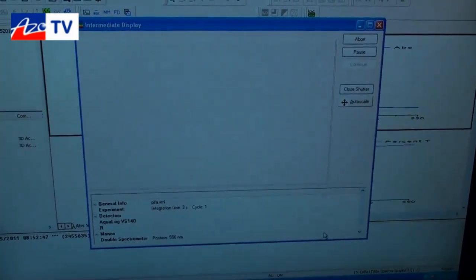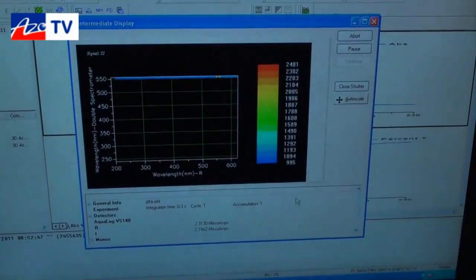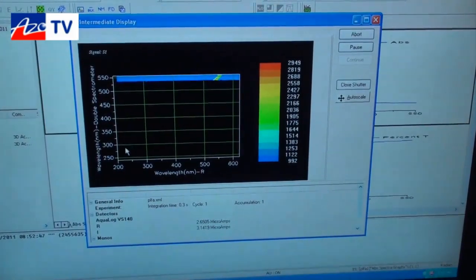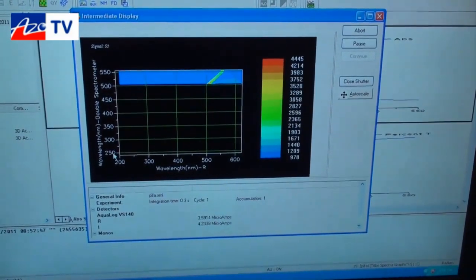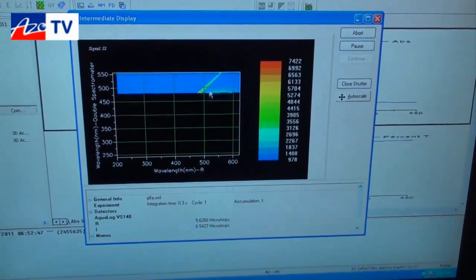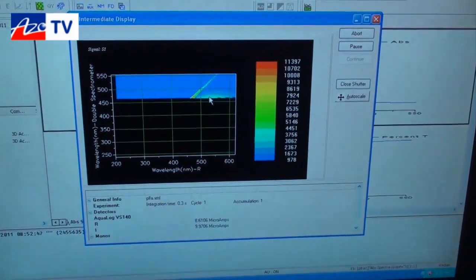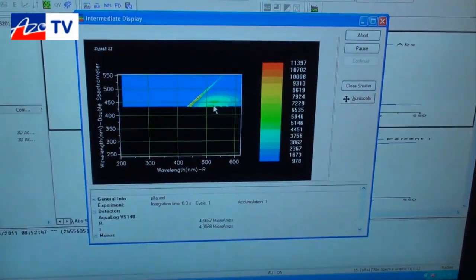So this is a picture of the data as it's being collected. So you'll notice we're scanning the excitation axis in reverse, again to minimize photo bleaching. And on this side we have the emission axis, which allows us to visualize the fluorescent compounds that are in the standard sample.